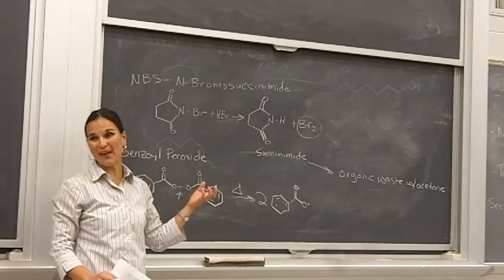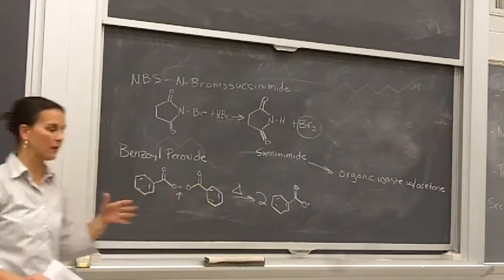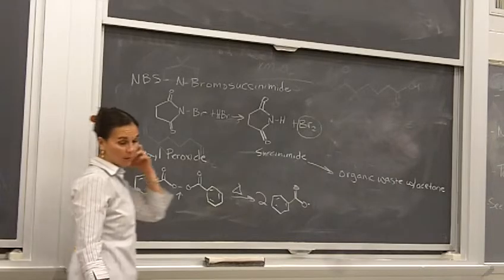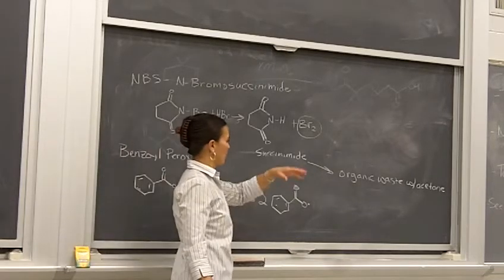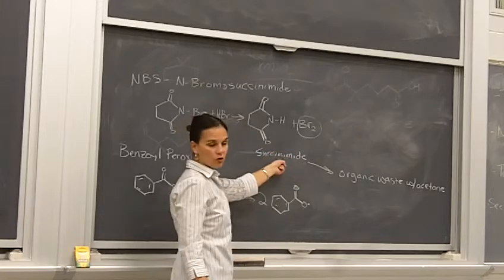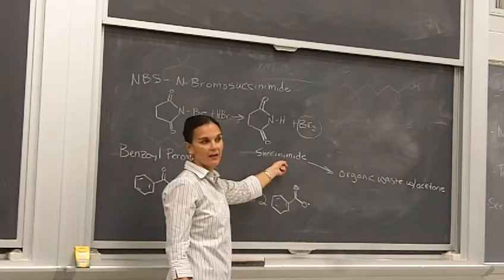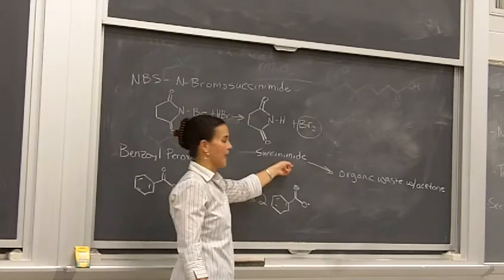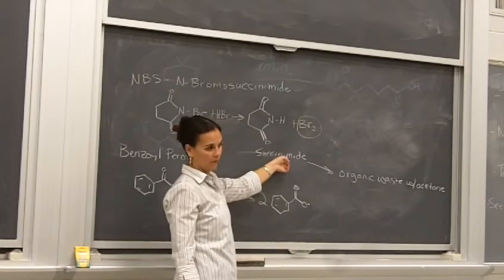We don't want to throw that in the garbage can because our bromoethylbenzene smells, it's got a really high stench on it, and it's still going to have chemical residue on it that we don't want to throw away, okay? So that filter paper will go in the filter paper waste. But just don't be tricked by the succinimide looking like that. You're thinking, oh yeah, there's my product right there. It's not. It's the byproduct. It's what we don't want, okay?